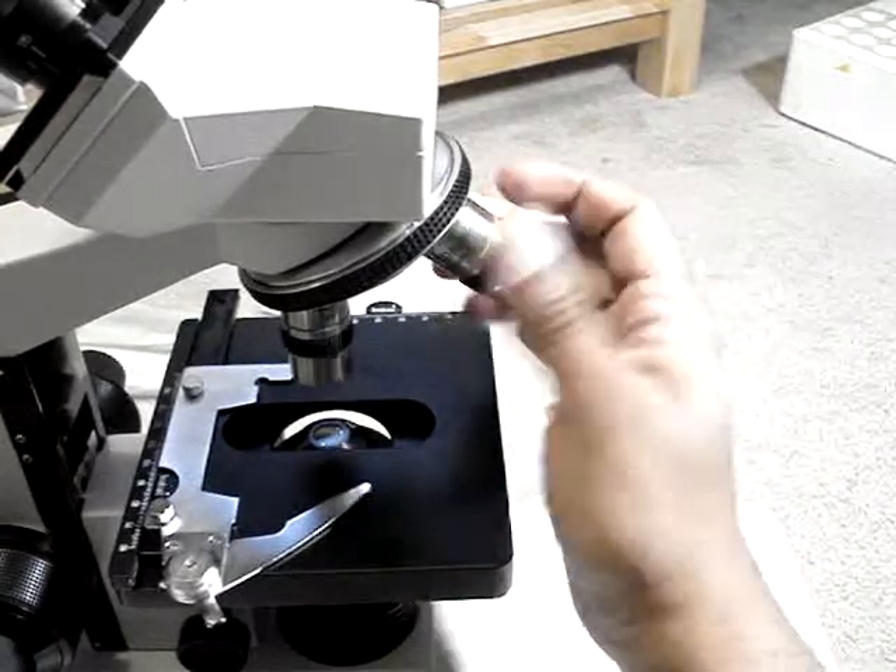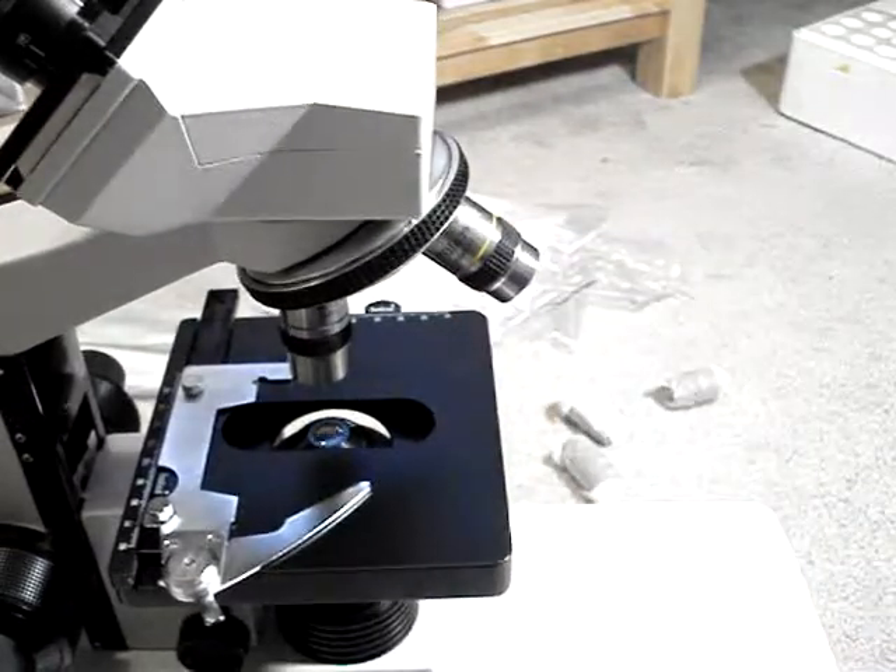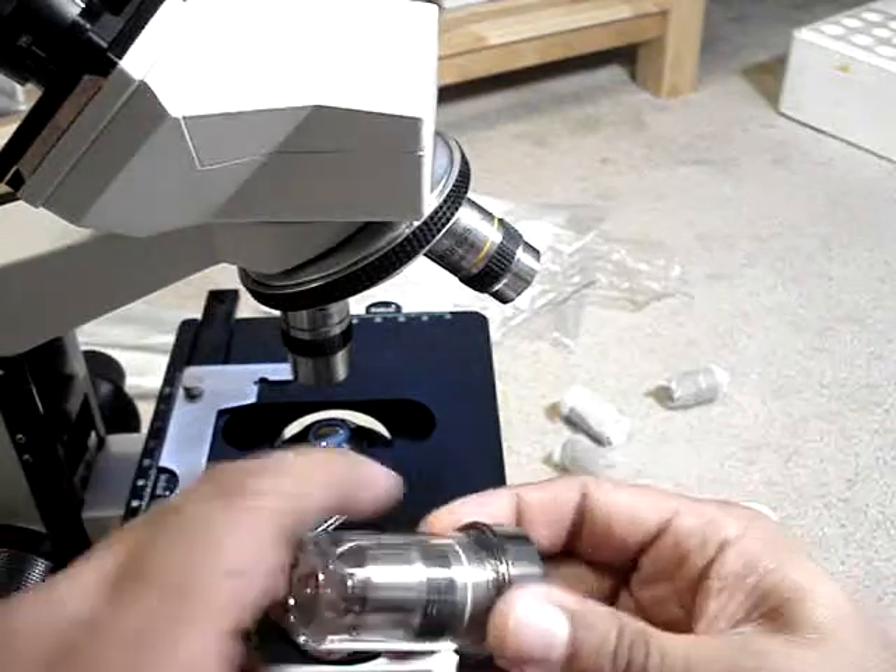It also has achromatic objective lenses.